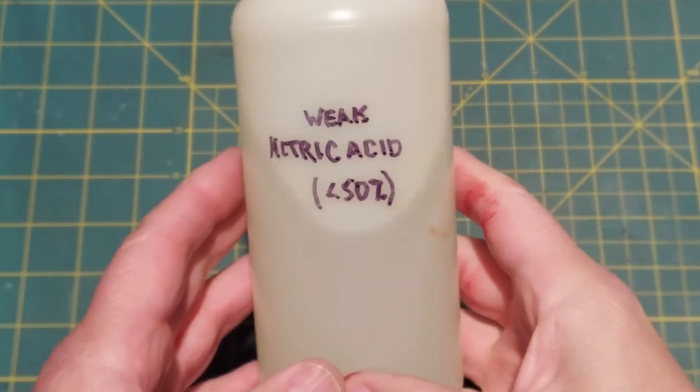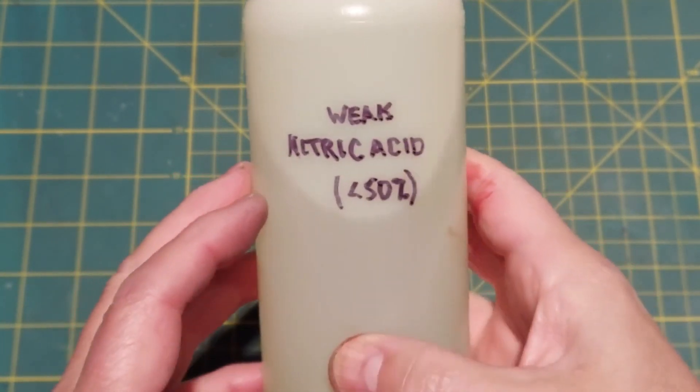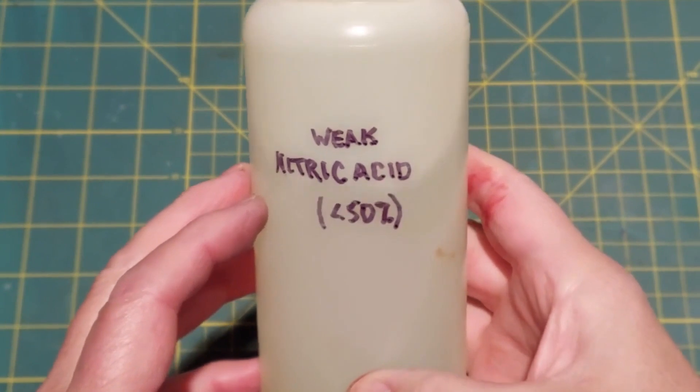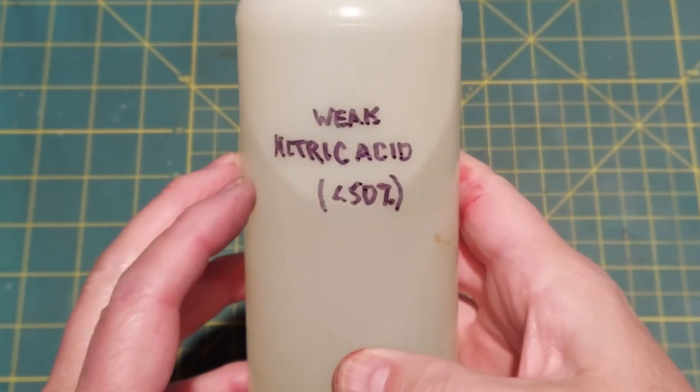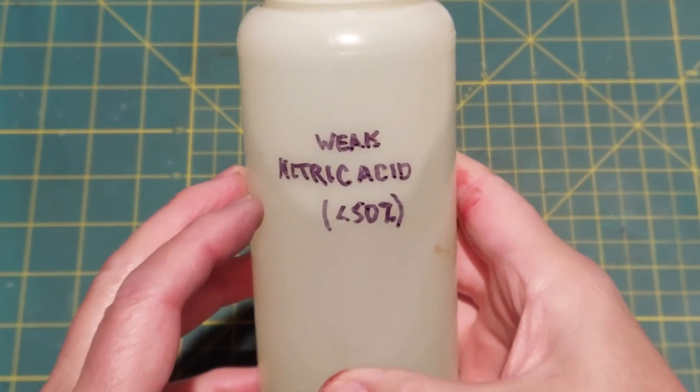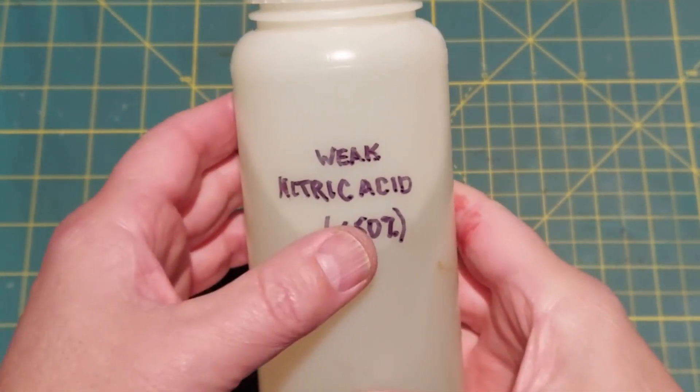This is a bottle of weak nitric acid that I've collected over the years. I'm guessing the collective percentage is less than 50%. However, there is a way to concentrate this if you need a stronger concentration, and let's look at how we do that.